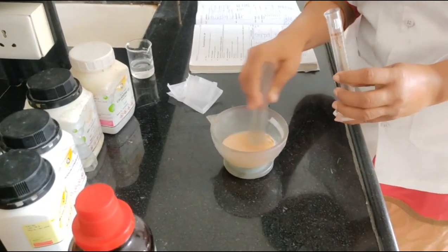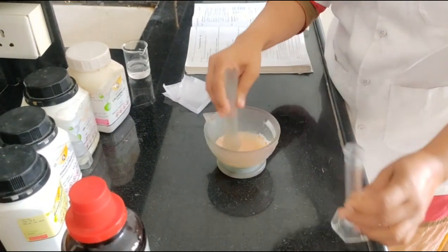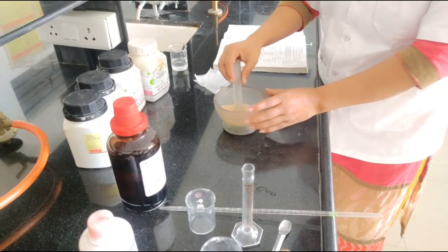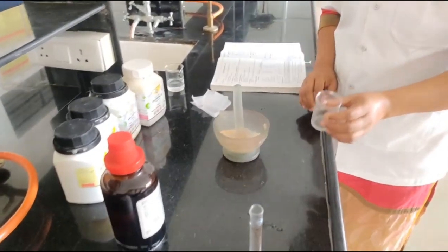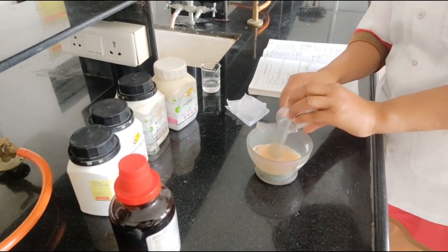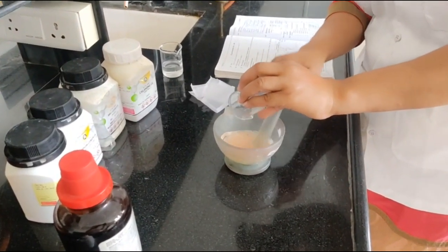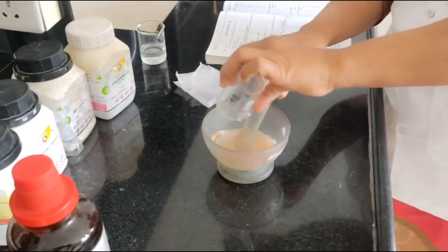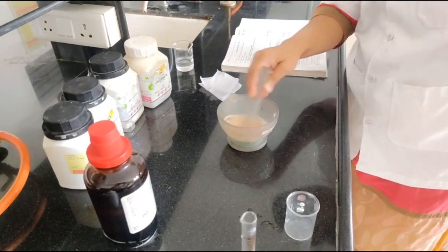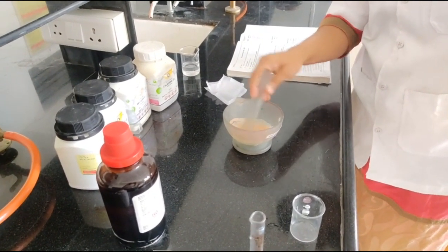Glycerin is added. First of all we add all 7 ml of water, and then we add the glycerin into our lotion. Here we measured 0.5 gram of glycerin. We added the glycerin. Glycerin is added to promote the adherence of the residual powder left after the evaporation of the vehicle onto the skin. Then bentonite is used as a suspending agent, and calamine and zinc oxide are used as protectants.